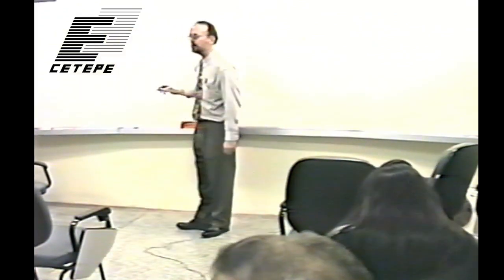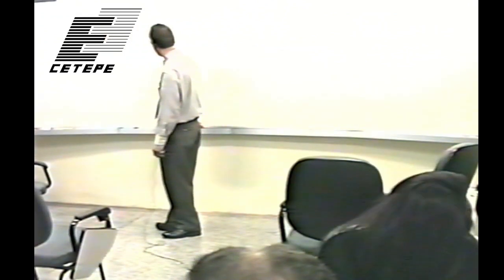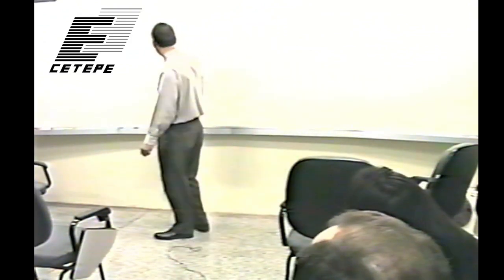This is about the exposure curve. Right. And this here would be the log relative exposure, like you said.